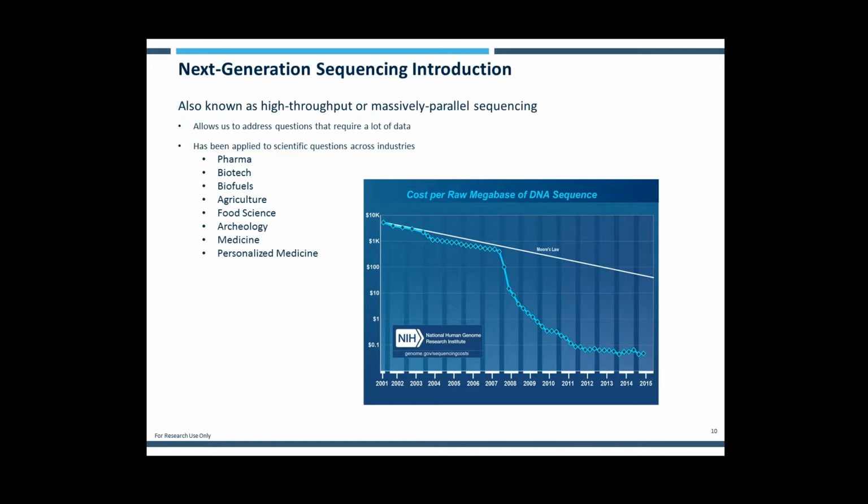So I wanted to start by just providing a brief introduction to next-generation sequencing. When we think about the advancement of next-generation sequencing, you can consider the invaluable resource that is provided to researchers in multiple industries and across multiple disciplines. And it's really going to be a major driver during the personalized medicine revolution that we're in the middle of.